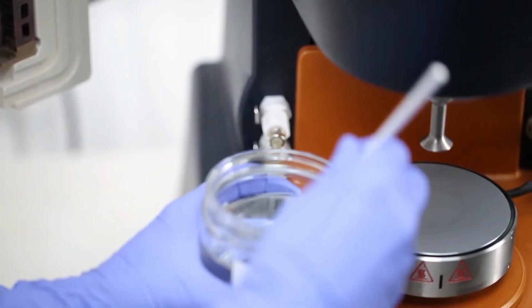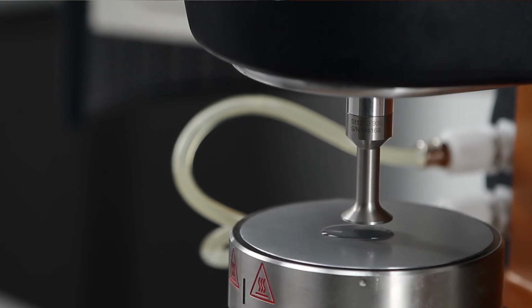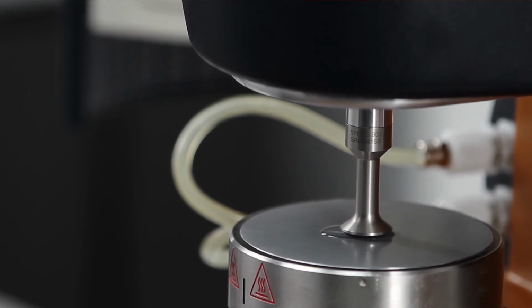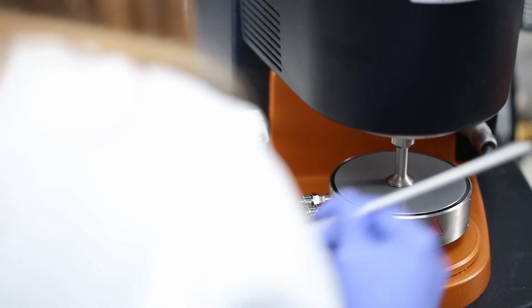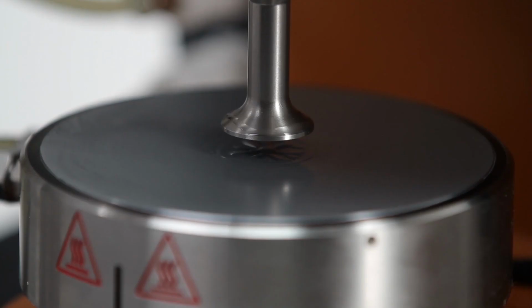Then place a small amount on the center plate and lower the spindle to meet the material. Once the spindle has reached the specified gap setting, we trim the material to the exact diameter of the spindle. We are running again at a shear rate of 5, and again we got a centipoise of 3,300.